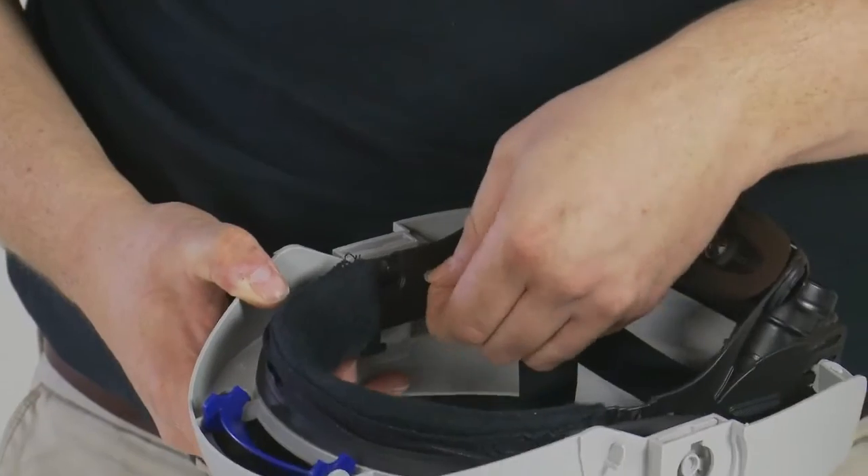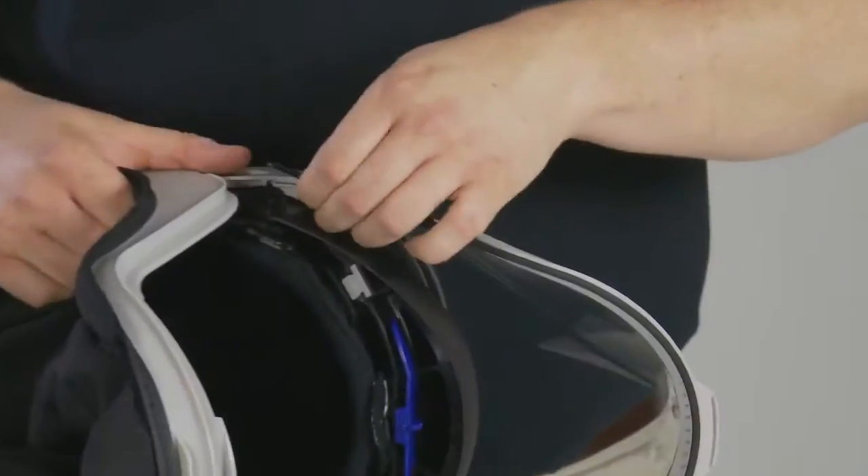Other parts that can be removed and replaced using the same simple attachment method include the brow seal and the jaw seal.